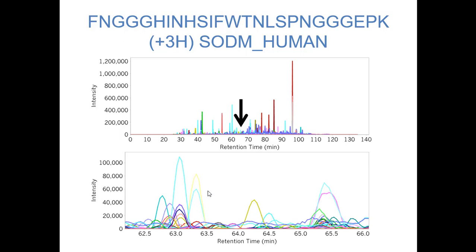Do you think this peptide over here is the indication for it? It's hard to see on these screens, but if you've got them up, you can pick them apart a bit. Or over here? This one? This one? It's that one. So how can I make that call? I have to use a computer program to make that call.